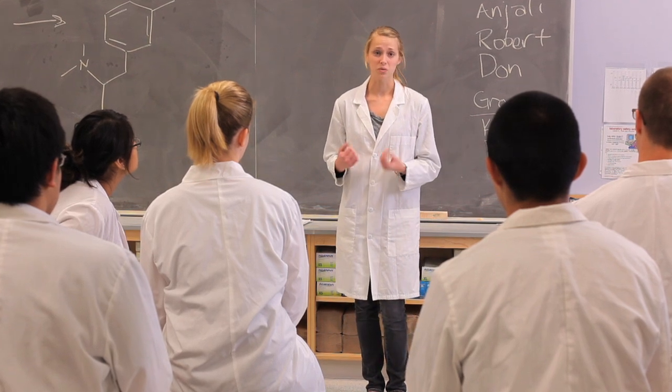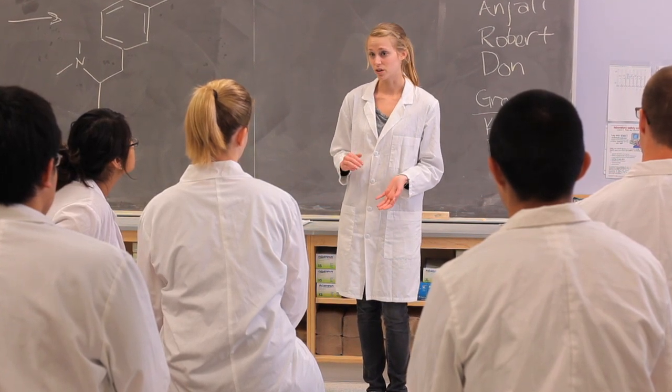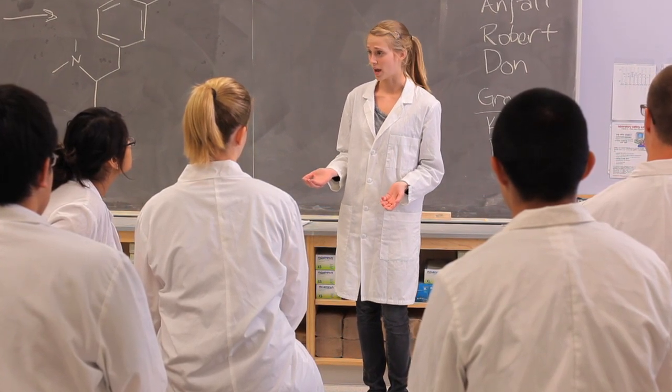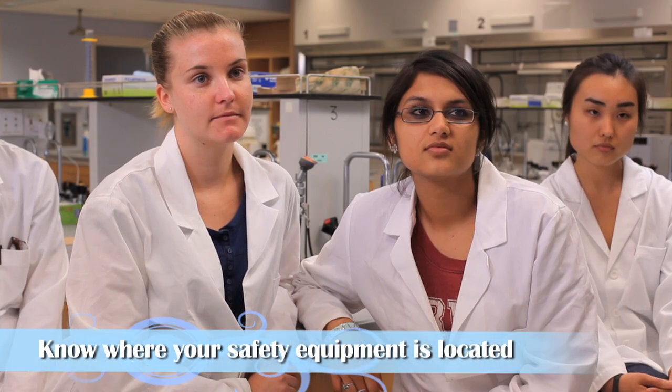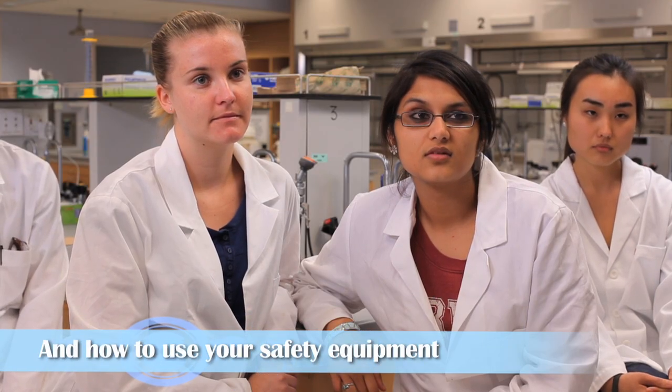If you get a spill on you, quickly peel off your lab coat, and if your lab coat absorbed all the spill, then you're okay. If your clothes are contaminated, you need to get into the shower and remove them under the running water. Seriously? I'm not taking my shirt off — they'll take pictures and put them on Facebook. Don't be silly, it's not worth getting hurt over. You're right. Fine, I'll pretend I'm at the beach or something.